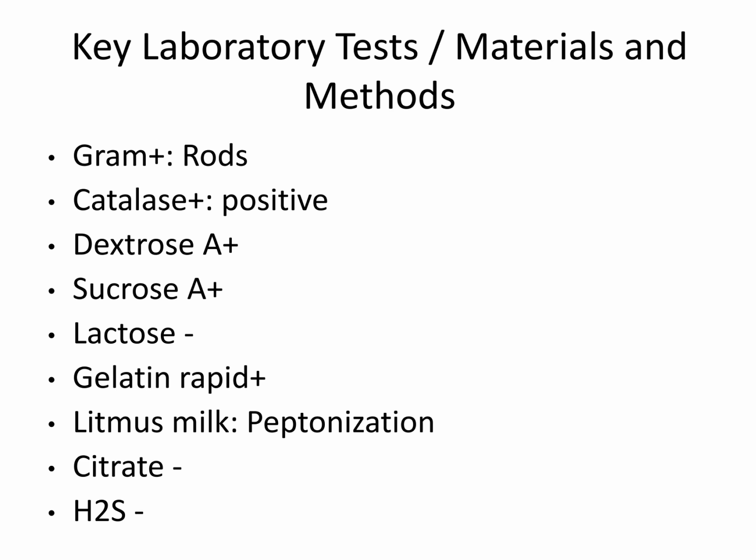The laboratory tests I chose to use were the Gram stain, and then the agar slant characteristics, the litmus milk reaction, lactose, sucrose, H2S production, citrate use, and the gelatin liquefaction. These are the results I had for each of the tests, which is filled out on the information sheet submitted.